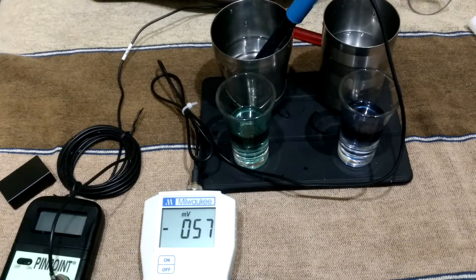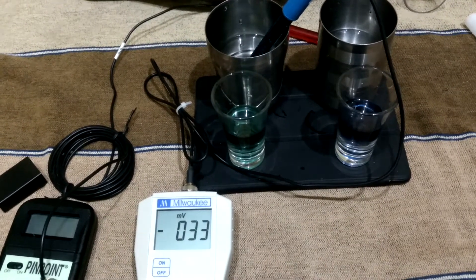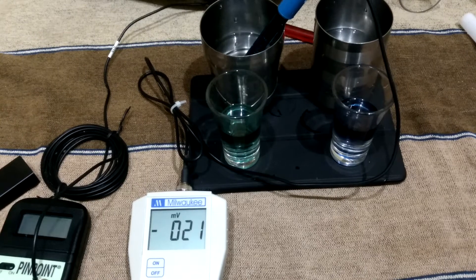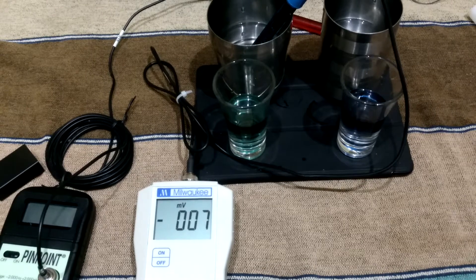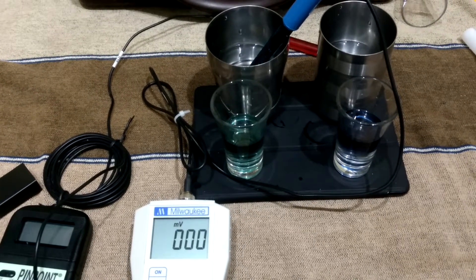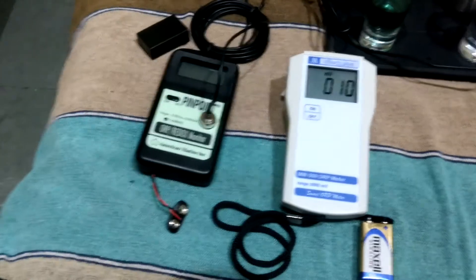It is still showing in the minus range, going very slowly upside. It is very slow. We will check it again. Now I will check our Pinpoint ORP meter.